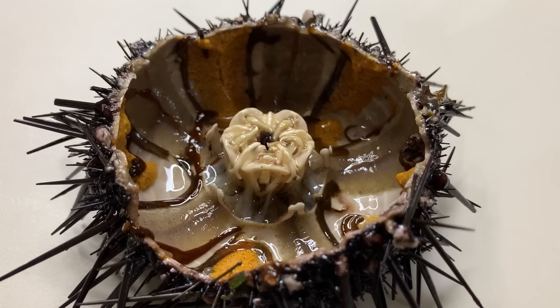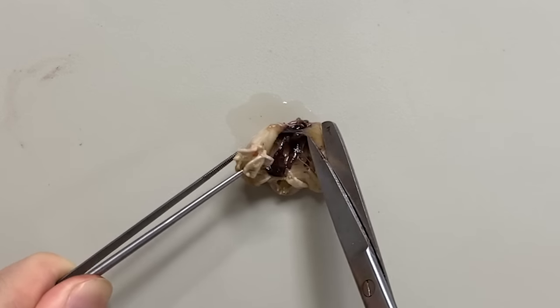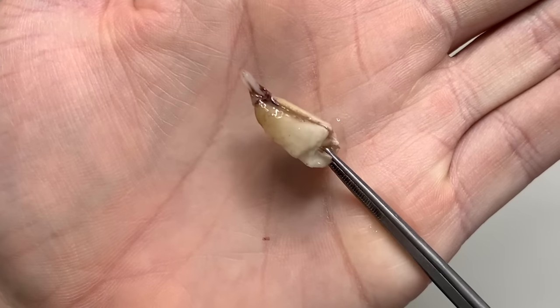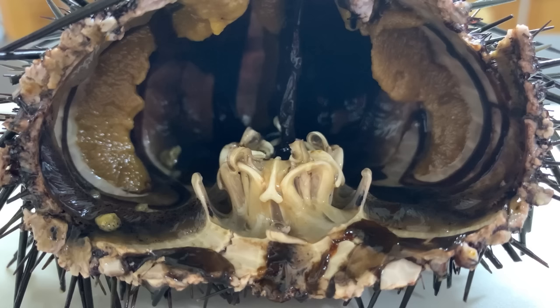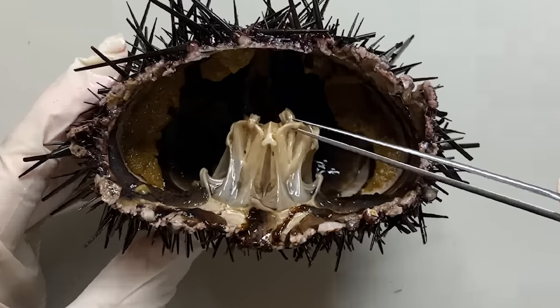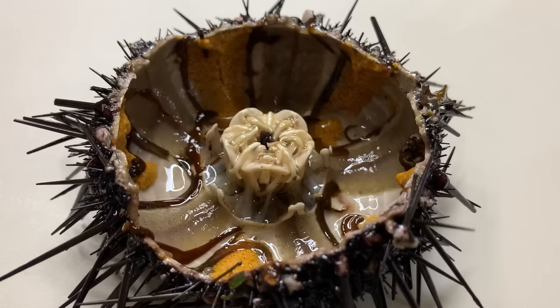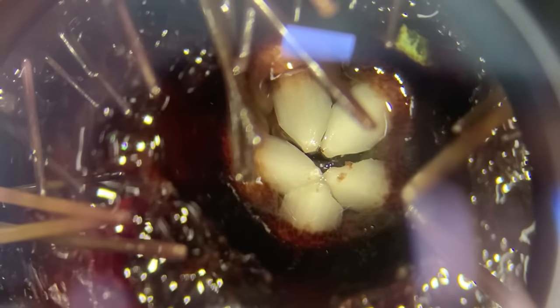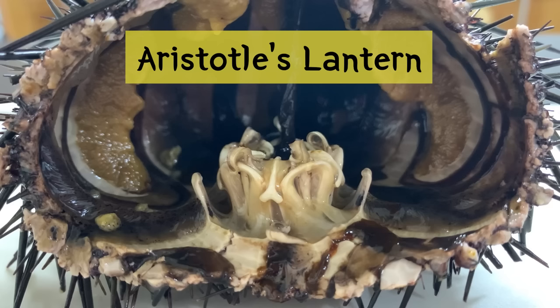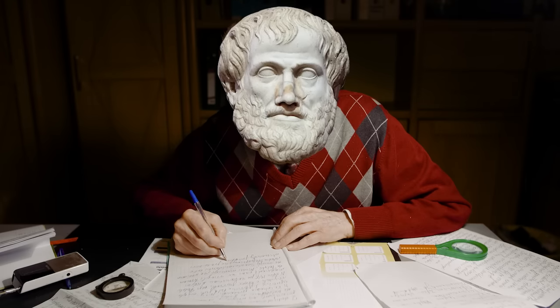This is the unique masticatory apparatus of sea urchins called Aristotle's lantern. If you take apart and dissect Aristotle's lantern, you can see that this area is a structure where teeth and flat ossicles are connected. Five ossicles came together to form the shape of a lantern, and at the lower part there are muscles that control the movement of the ossicles. Sea urchins use this masticatory apparatus to move their teeth and gnaw prey such as algae. The name Aristotle's lantern comes from Aristotle, who dissected a sea urchin and described it as similar to a lantern.